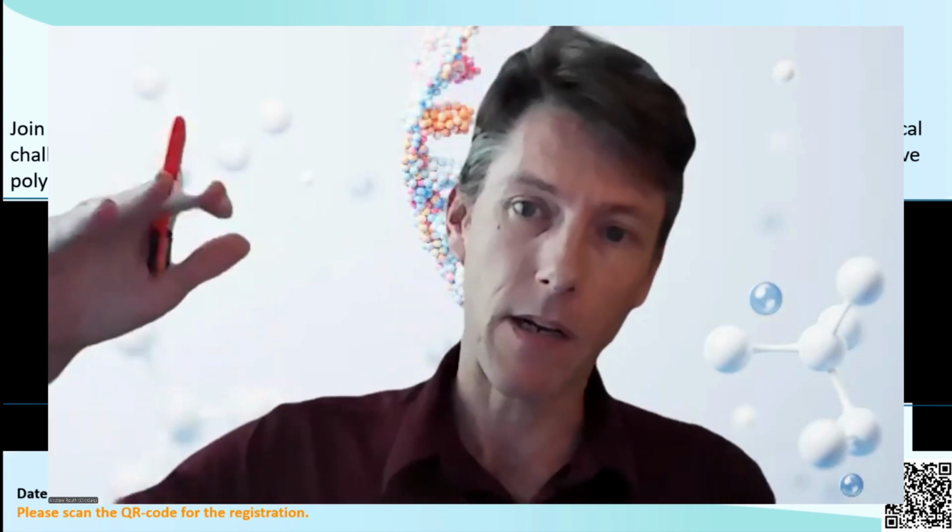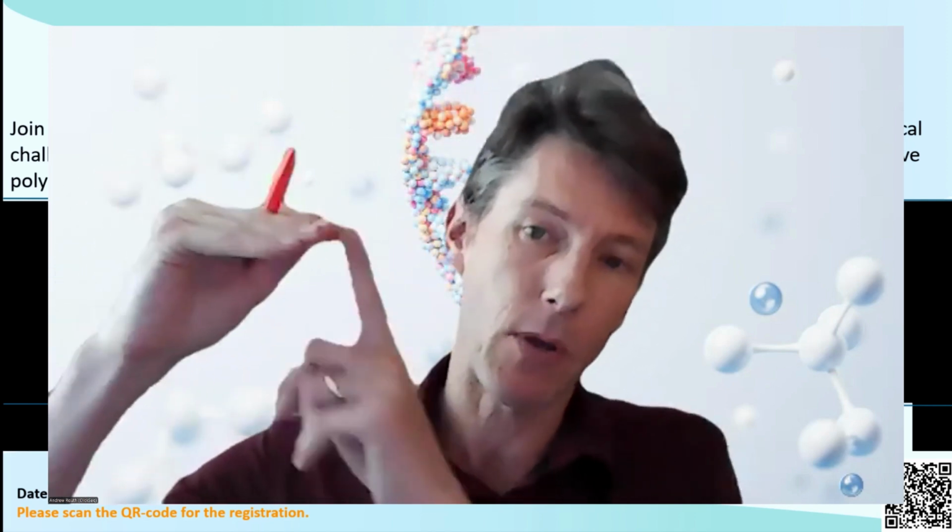But with Tiled-ClickSeq, because we only have one primer per amplicon, we can sequence essentially whatever is upstream, whether it's a recombination event, different size recombination events, fusion events, you name it. And we've shown this in our clinical studies that this is the case, and this works quite nicely. So I'd say those are the three main advantages. And it's not just us in our lab who's validated this independently. Other groups have used ClickSeq and reanalyzed data and shown that this is the case too.